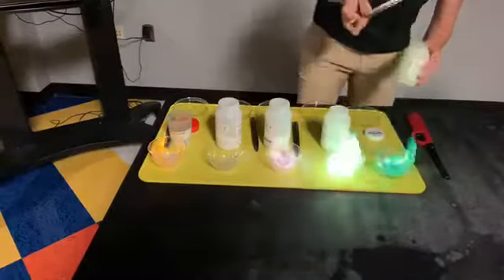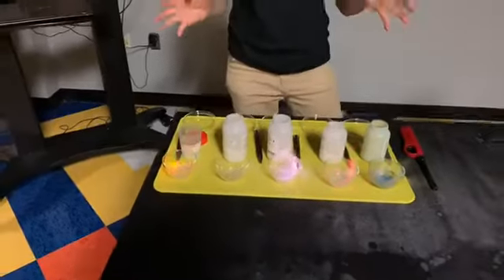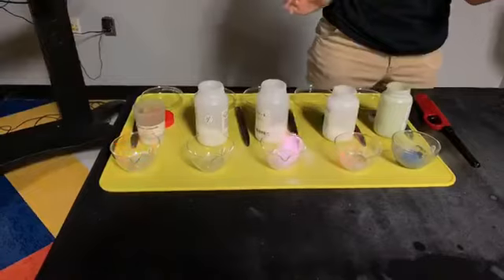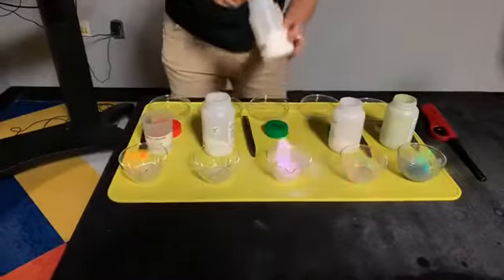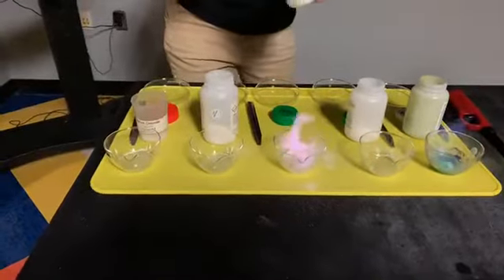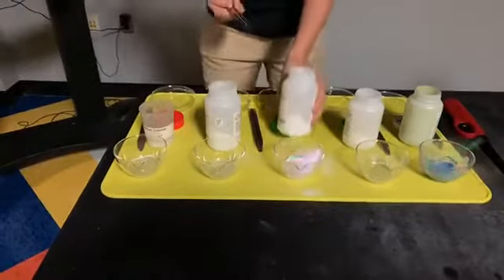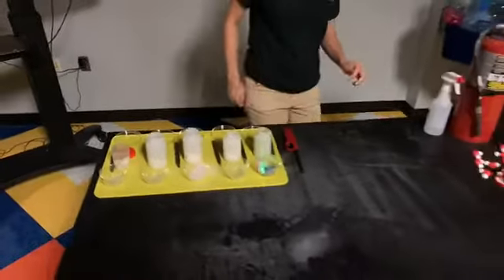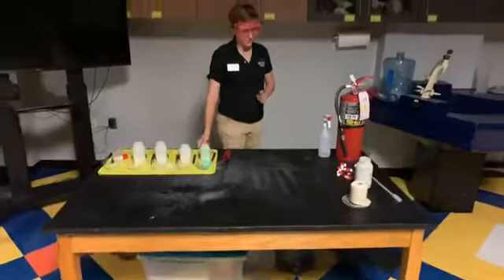Love it. Kind of mix them all together. This is one of my favorite experiments to look at. It's very, very cool. All right. Is it possible to make a purple fire? So this is about as close as I've got with my substances, with the potassium, for that nice bluish purple. I'm not familiar with which chemical might burn purple, but every single different salt is going to burn a different color.